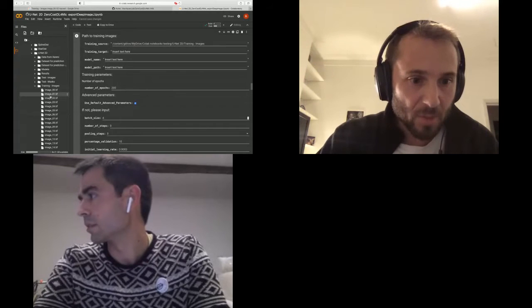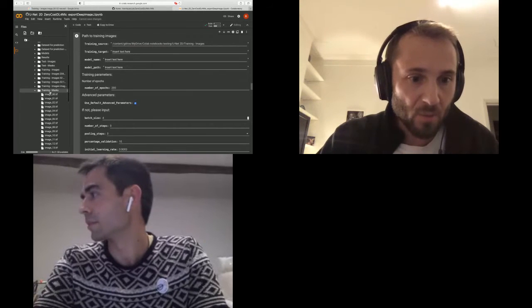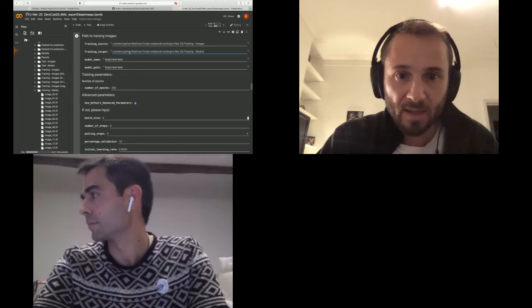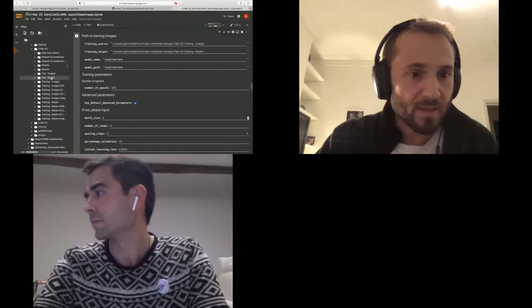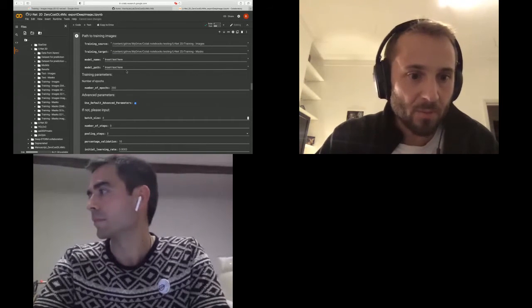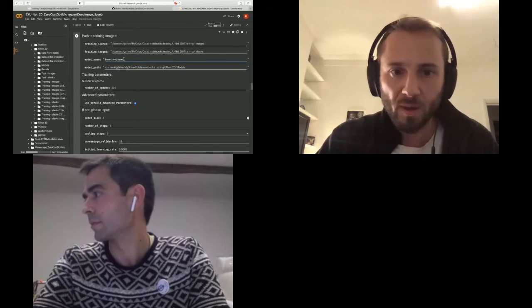I've got a bunch of images in my training images folder. I'm going to copy the path in here. Similarly, with a one-to-one correspondence, I've got all the masks right here, and I can give it the path to the data. Now we've given it all the data, so it will know where to find it. I've also got a folder for the models, so I'm going to copy the path to the folder for all the models right here.